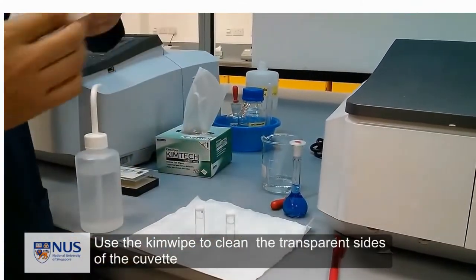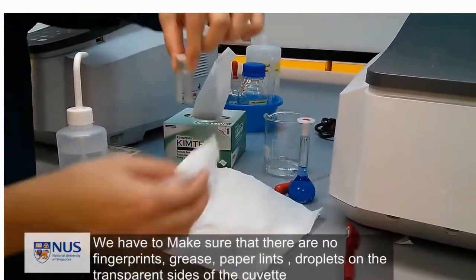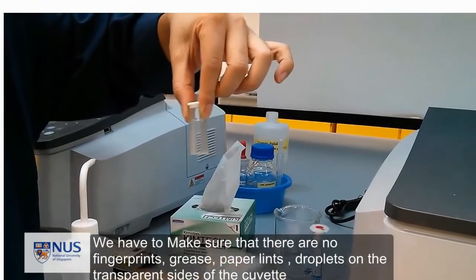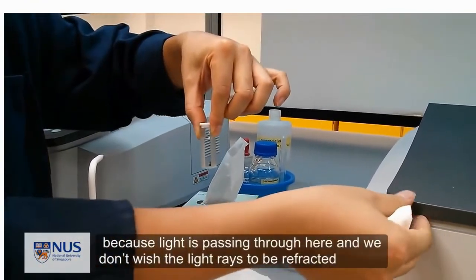Now use the Kim wipe to clean the transparent sides of the cuvette. We have to make sure that there are no fingerprints, grease, paper lints, or droplets on the transparent sides of the cuvette because light is passing through here and we don't wish the light rays to be refracted.